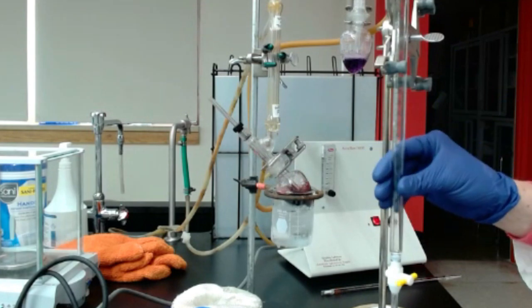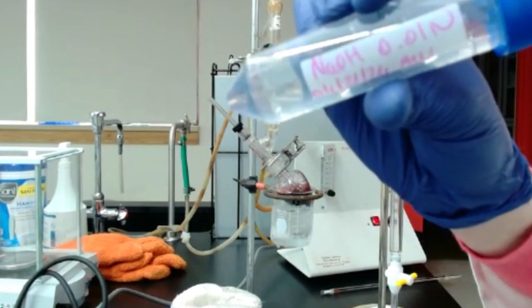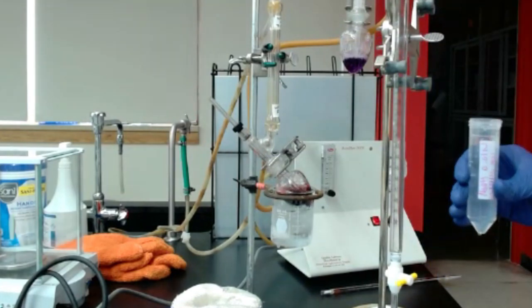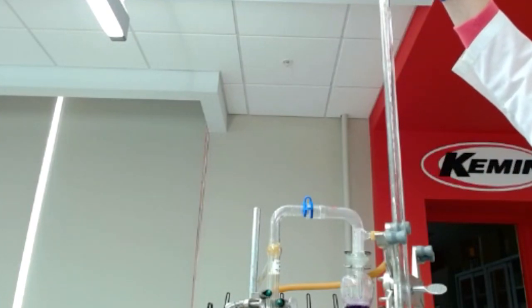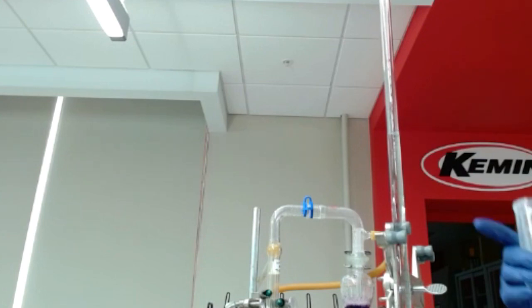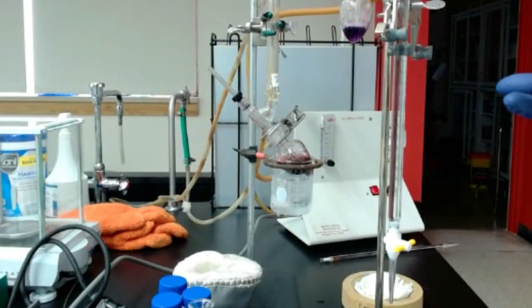So I have to bring some sodium hydroxide solution first into that burette. That's going to be the sodium hydroxide solution of 0.01 normal, the same that I used to adjust the color of that flask D. To add into your burette, you can use a funnel. Sometimes that's safer than if you just do it by hand like that. So with just a funnel, I transfer. I'm going to have probably 20, hopefully. All right. I don't add sodium hydroxide all the way to the top because I'm just going to measure a few samples today. But if you plan to do 10 samples, you might need to add more sodium hydroxide in your burette.